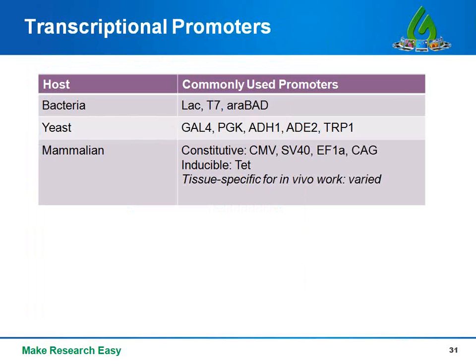So just a quick review, there are many different transcriptional promoters that can be used. And these transcriptional promoters are often modular parts that you can easily swap in and out. These are just a few of the commonly used promoters, but you might want to look at what promoter you're using in your expression vector and think about trying a different one.